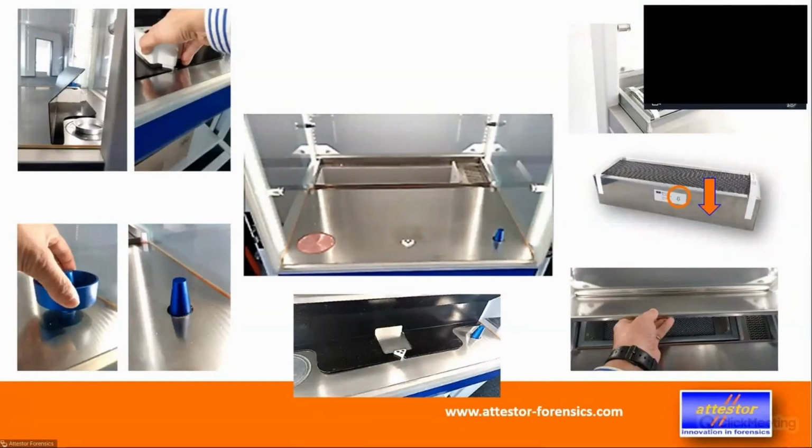And then after a while, our sensor inside the chamber will say, okay, I'm close to my set point, so I'm probably approaching the 80% humidity. Please stop humidifying. If you then switch off only the humidifier, the water in that pot is still hot and will still evaporate out of the pot for a certain time. Therefore, in order to stop that faster, that pin can not only heat, it can also cool.